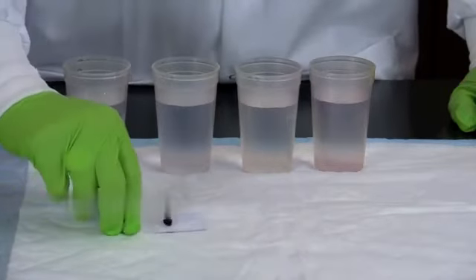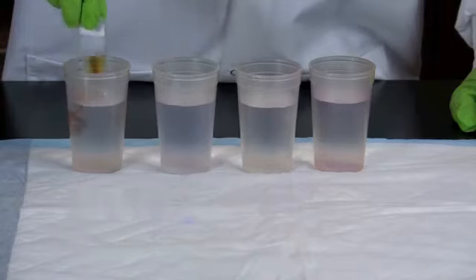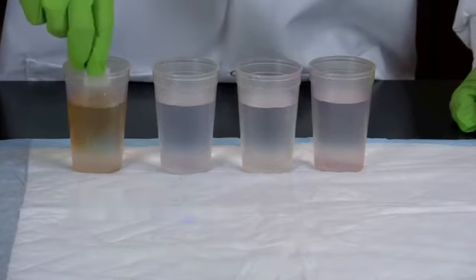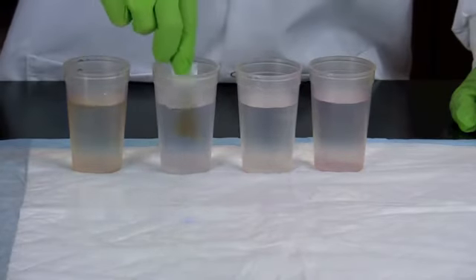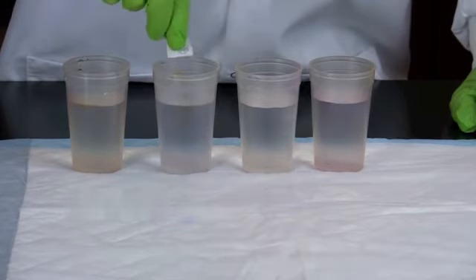Rinse the slide in a beaker of water until most of the iodine is gone. A second beaker of water can be used to ensure most of the iodine has been rinsed off.